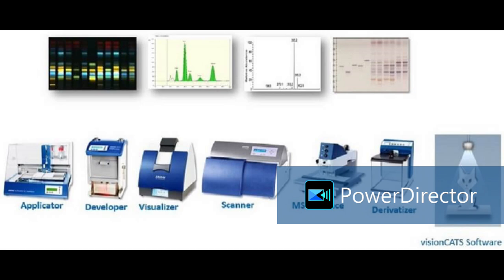Yes. So this is the complete Camag HPTLC system setup, right from sample application to chromatographic development, derivatization, detection. So it is a modular system. There are different modules to perform each and every step involved in the analysis, right from sample application to development, derivatization, detection. For each step, we are using a separate instrumental module.